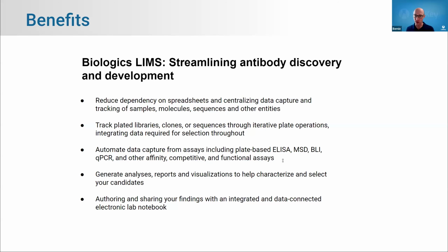And of course, the integration of the information that you're capturing through those iterative plate operations really helps facilitate decision making. Much of the data capture and analysis can be automated. LabKey can listen for new data that you're generating, or you can simply throw your plate reads and other results at it, and it will automatically associate the right data with the right well, right sample, and ultimately the right entity upstream of that. And we will also generate those calculations and visualizations that you need for your analysis and selection automatically.